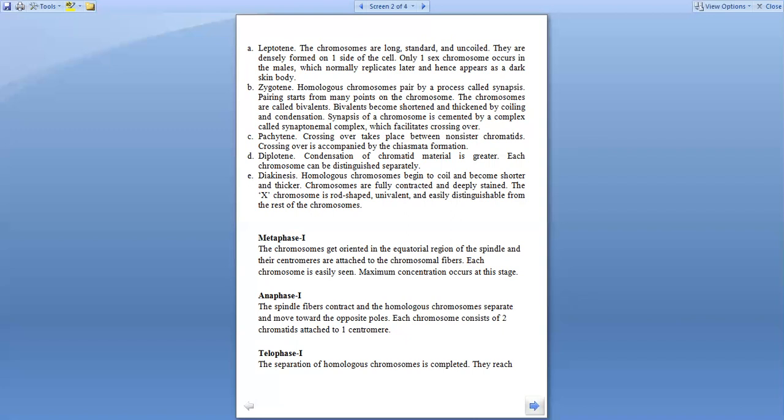After this is the pachytene stage. At this stage chromosome crossing over takes place and this is accompanied by the formation of chiasmata.